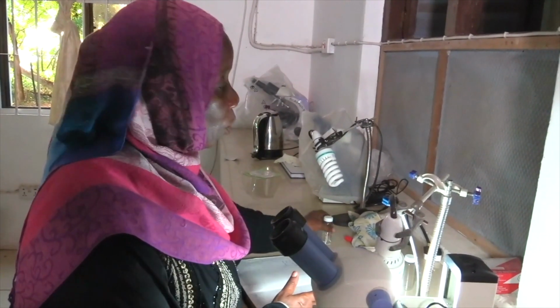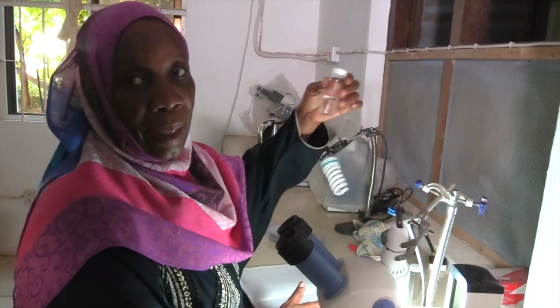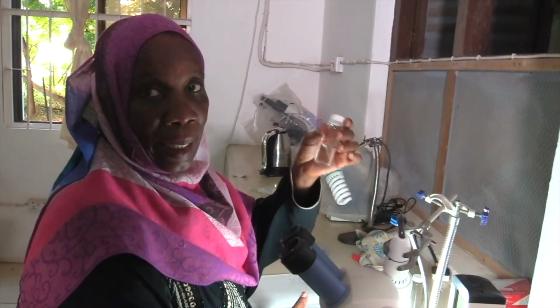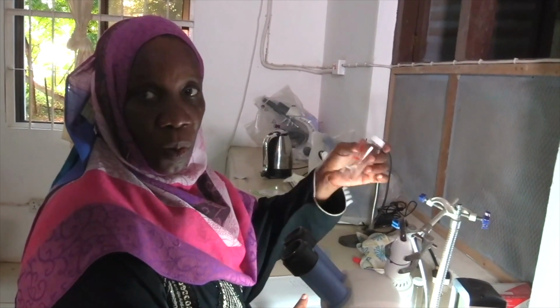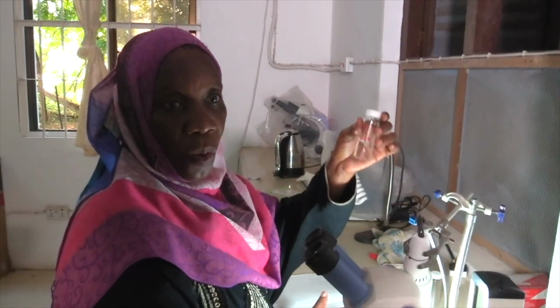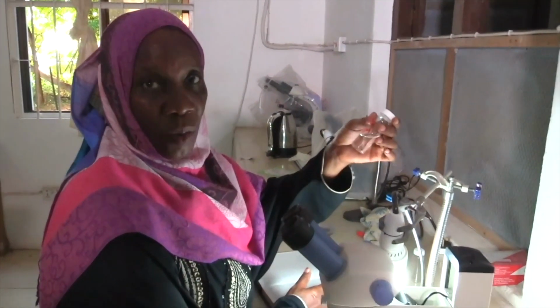After that, this goes to polymer analysis or polymer detection. Here you can find what kind of plastic it is, and the composition, even the functional groups, or what the material or group is, whether there is heavy metal or what kind of plastic it is.